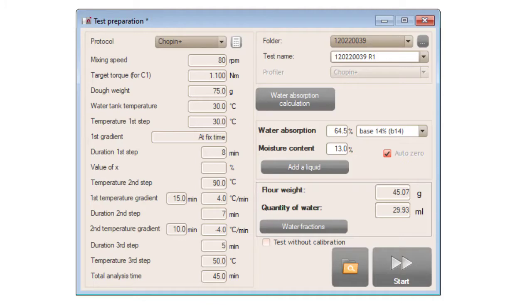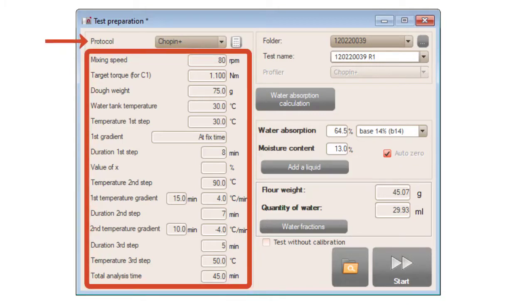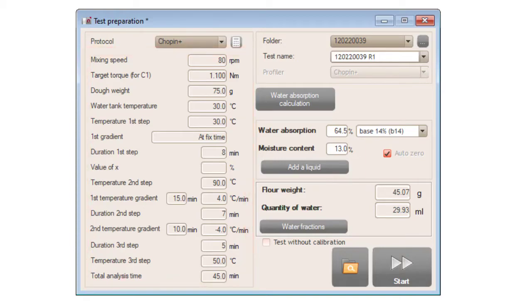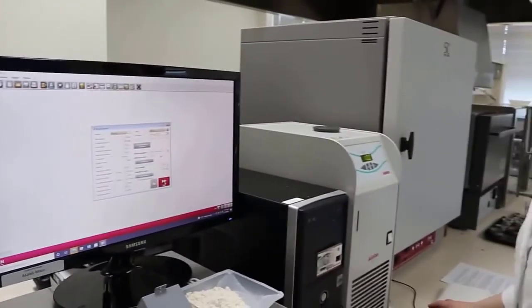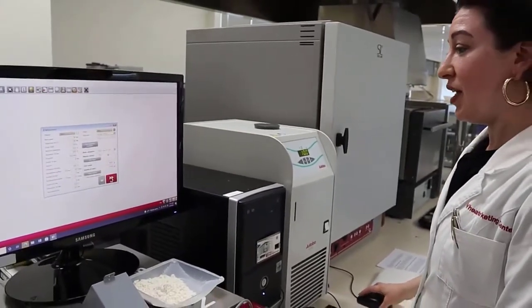So I've already decided that I'm going to use the Chopin Plus protocol. It lists all the parameters right here, but of course, you can always change these parameters and choose a different protocol if this is not ideal for the flour you want to test. So let's go ahead and start the test.